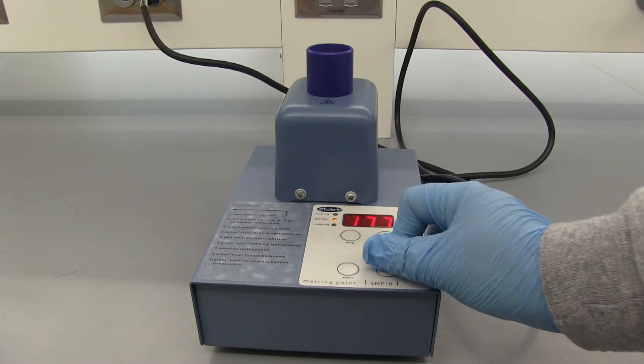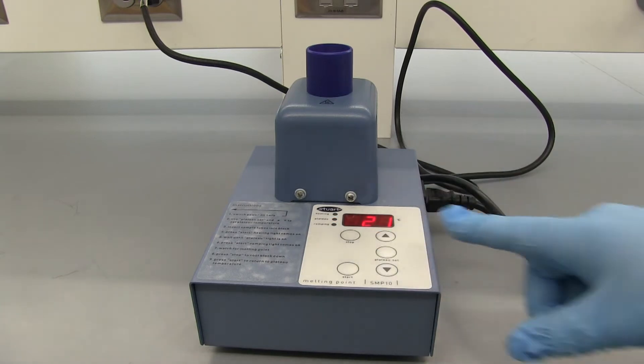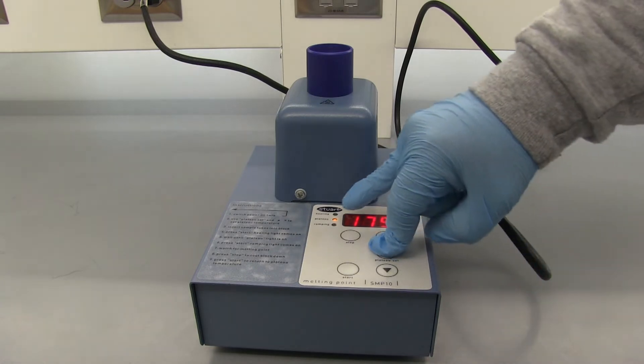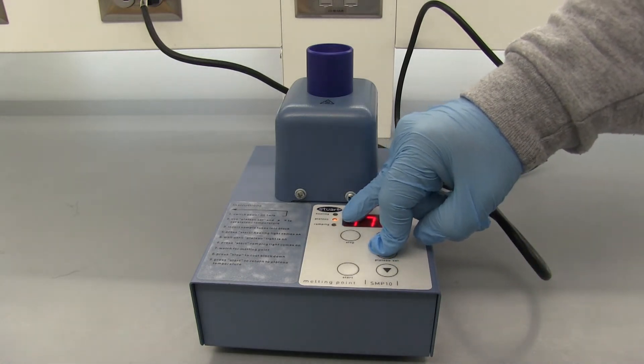For this fast melting point we're just looking for a range. Alright, so now if we hold the plateau set you can see that it's at 175 and the second light is blinking orange which means we are setting the plateau.